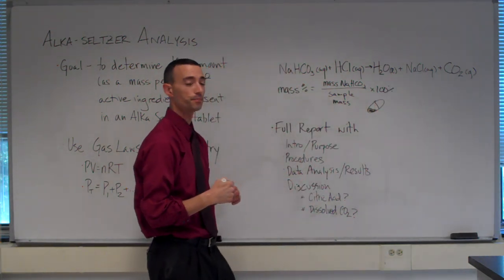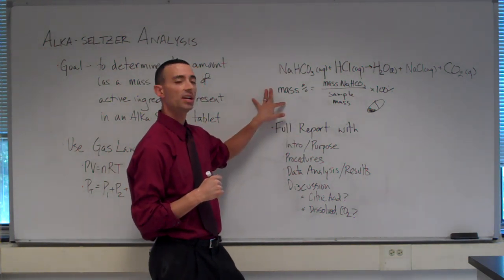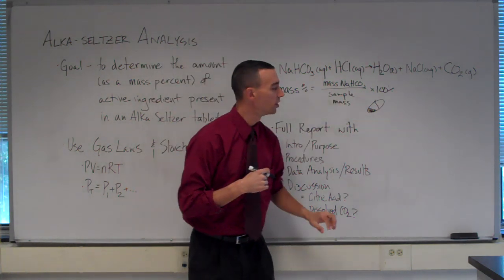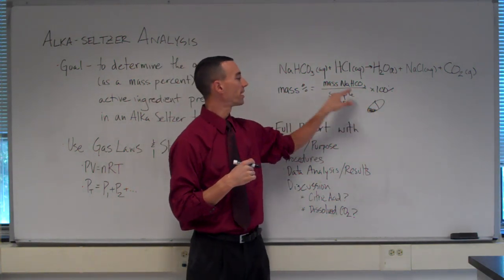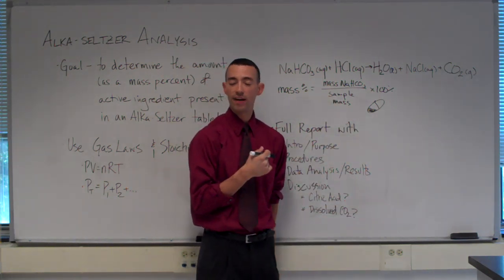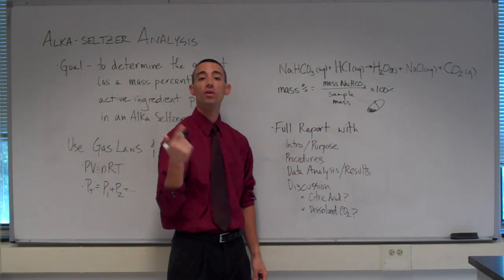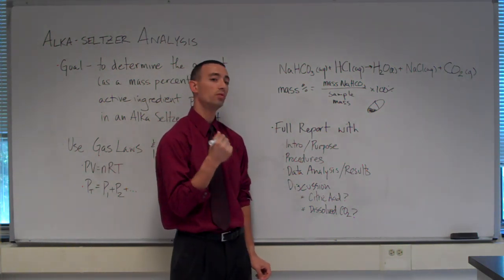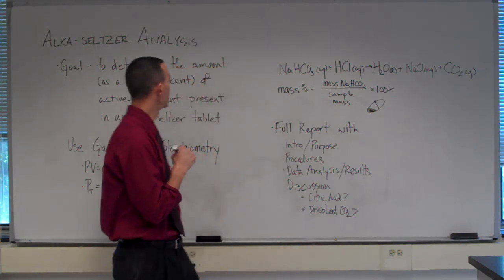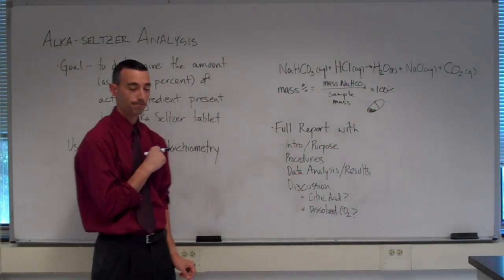percentage. Okay? You'll do the experiment 3 times, get an average of this, and then you'll be able to scale up from your little sample to how much sodium bicarbonate should be in an entire tablet of Alka Seltzer, and you can compare that to the value listed on the box. So be sure to read the box of Alka Seltzer because it has to, by law, indicate how much of its active ingredient is present.